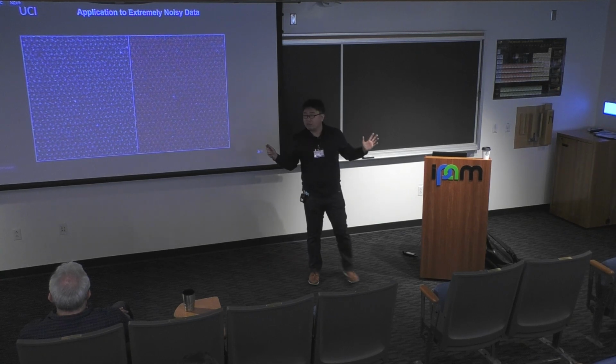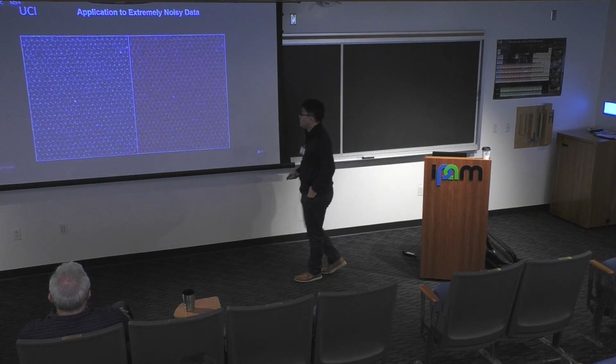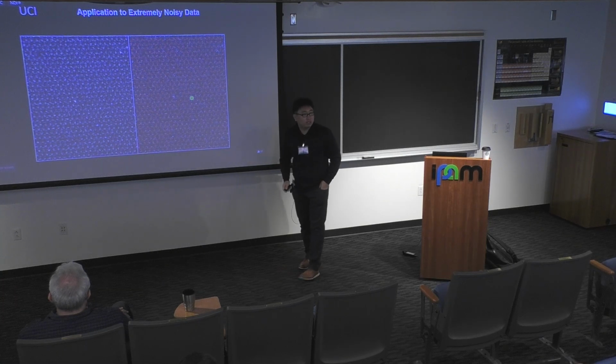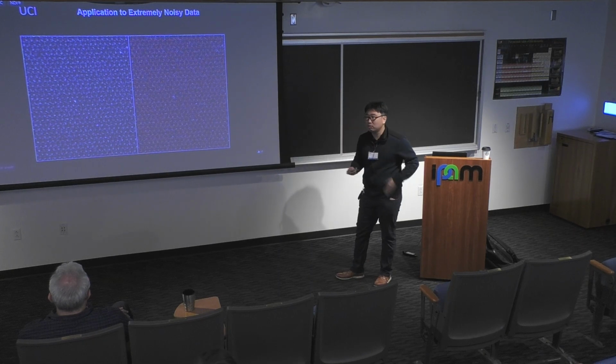You can do whatever Bayesian analysis you want on it to give you the uncertainty that physicists really care about, with all of these initial guesses. So you don't have to use your atomic locator to work on such noisy images.